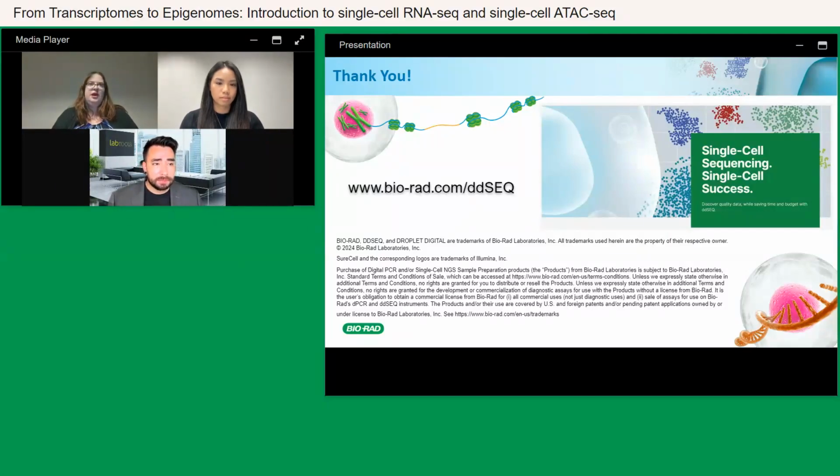Yeah, this kind of work I typically do with Signac. Now with Signac, you would need to bring the two samples together, and then subset that Seurat object on the cluster. And then you can use the FindMarkers function, but you have to change the idents into looking at the treatment option and not cluster, because it automatically goes to cluster. And then you should be able to do this type of comparison in the single-cell ATAC-seq data. It's maybe not super clear, but once you go deep into those functionalities and the different options in functions like FindMarkers, you can do this type of analysis.